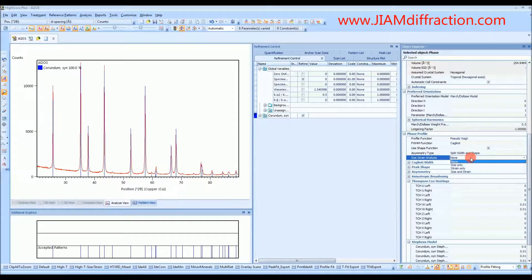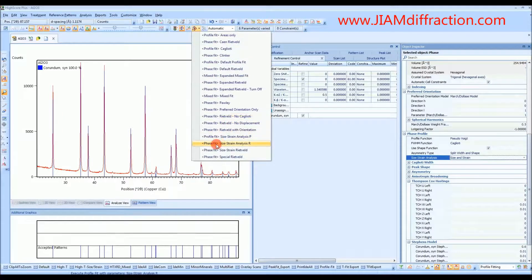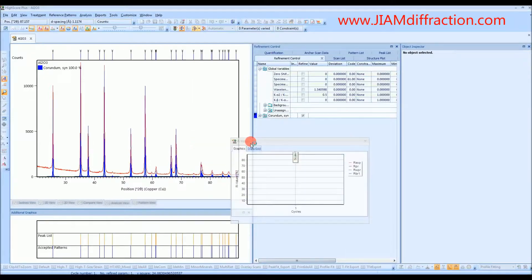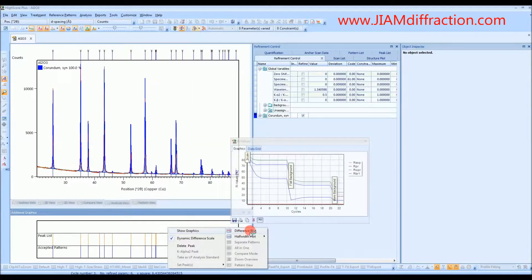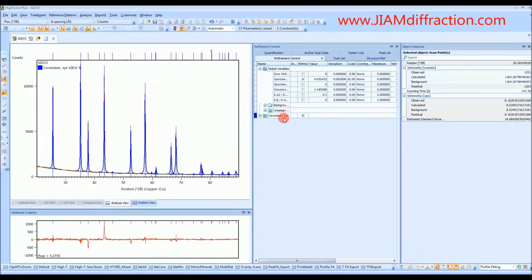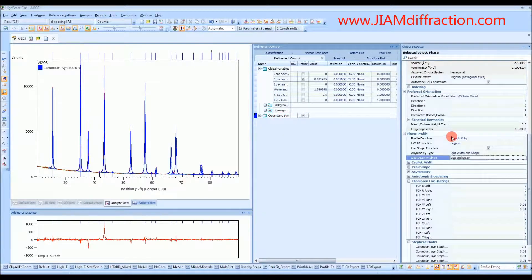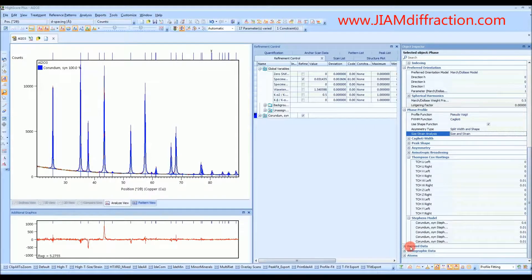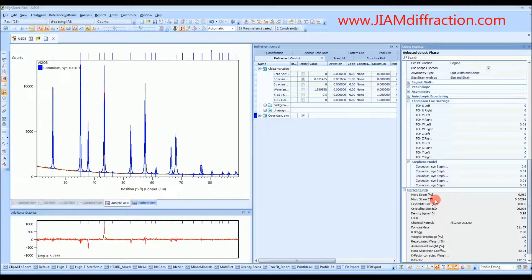This time, you do want to perform a size and strain analysis. So we'll go up here and use that same phase fit size-strain analysis R. I will go back to the difference plot. If we click on corundum and scroll all the way to the bottom, we see the derived data. Click the plus sign, and here we have the microstrain, the error on the microstrain, the crystallite size, and the error. We see that we have about 0.08% microstrain and about 830 angstroms for the crystallite size.